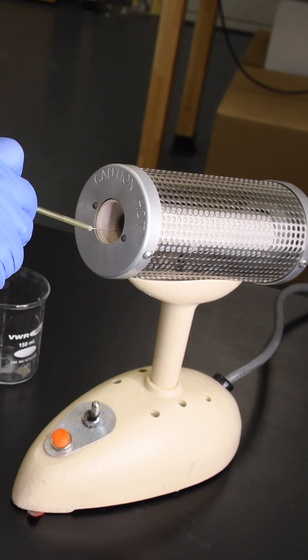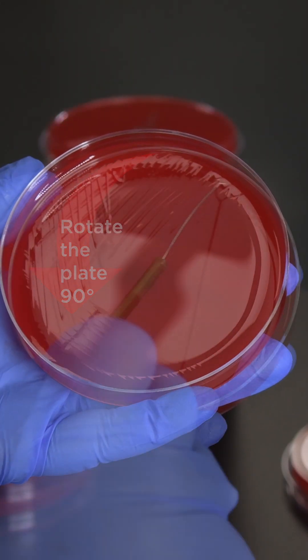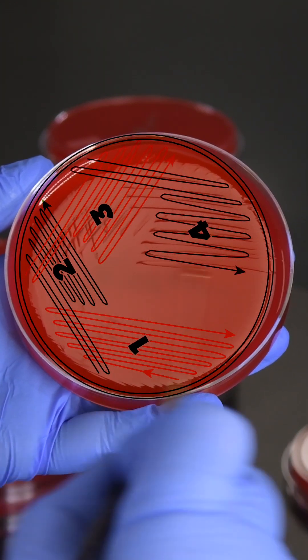Re-sterilize and cool the loop one last time before continuing. Turn the plate a final 90 degrees and streak the cells from quadrant three into quadrant four.